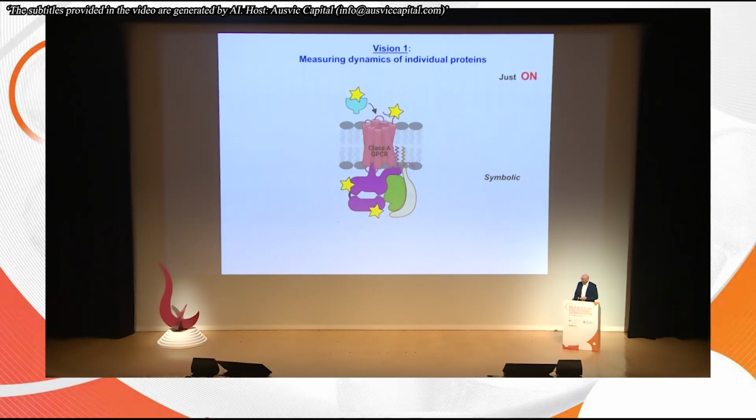And I think this has important implications, because what you can imagine now is to do the following experiment. So this is a protein. It's not a specific one in that sense. And of course, we now know protein structure from X-ray crystallography, NMR, cryo-EM, and AlphaFold by now. But it's not so easy to understand the function mechanistically. But what we could do now is attach these fluorophores basically to 3, 4, 5 points of the same color. You can add also other colors if you want. There's nothing wrong with that, and watch them move. And then we understand how the protein works.